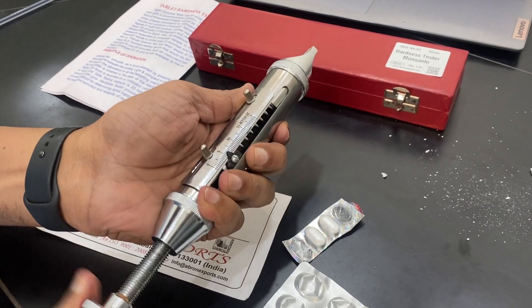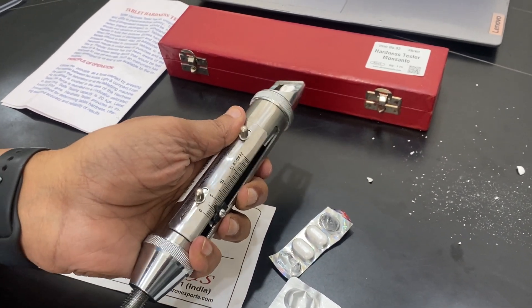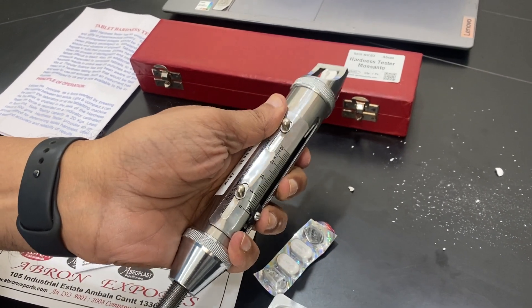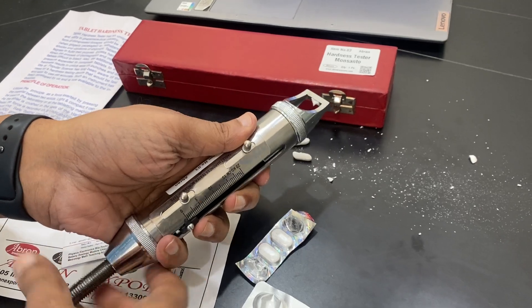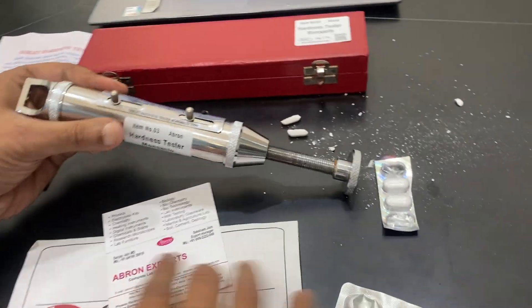So I have done the test and shown you the working. It is very easy. You can open it and see the strength of the tablet, which depends on the binding material that is fitted inside the tablet. Now I have done it — very easy to use. This is a manual system.